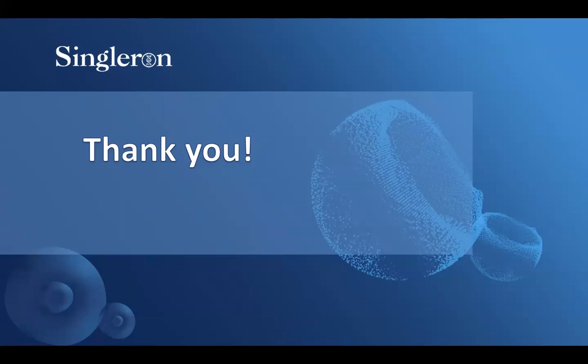Thanks. Okay, three questions in one go. All right, so the first one was, can anyone produce their own barcodes? Yes, it is possible. If you have the tools for that, sure. I know some labs that were producing their own barcoded beads, but usually if you buy the kit from a particular company, they provide the barcoded beads. So this is one thing, but of course you are allowed to design your own barcodes as well. It's up to you.